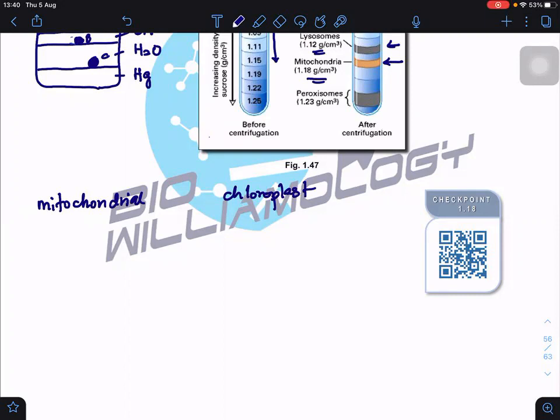Okay, mitochondria. Okay, got fluid inside. Okay, what else? Yeah, you can direct message me. So someone says chloroplast because it has starch. Okay, good. I want you guys to think. Now think about it. We studied chloroplast, we studied mitochondria. So which one? Because they are in the same pellet 2. Both of them come from pellet 2. Mitochondria, chloroplast, any reason? Larger, heavier. Larger is not necessarily heavier, okay, but it's good. What else?